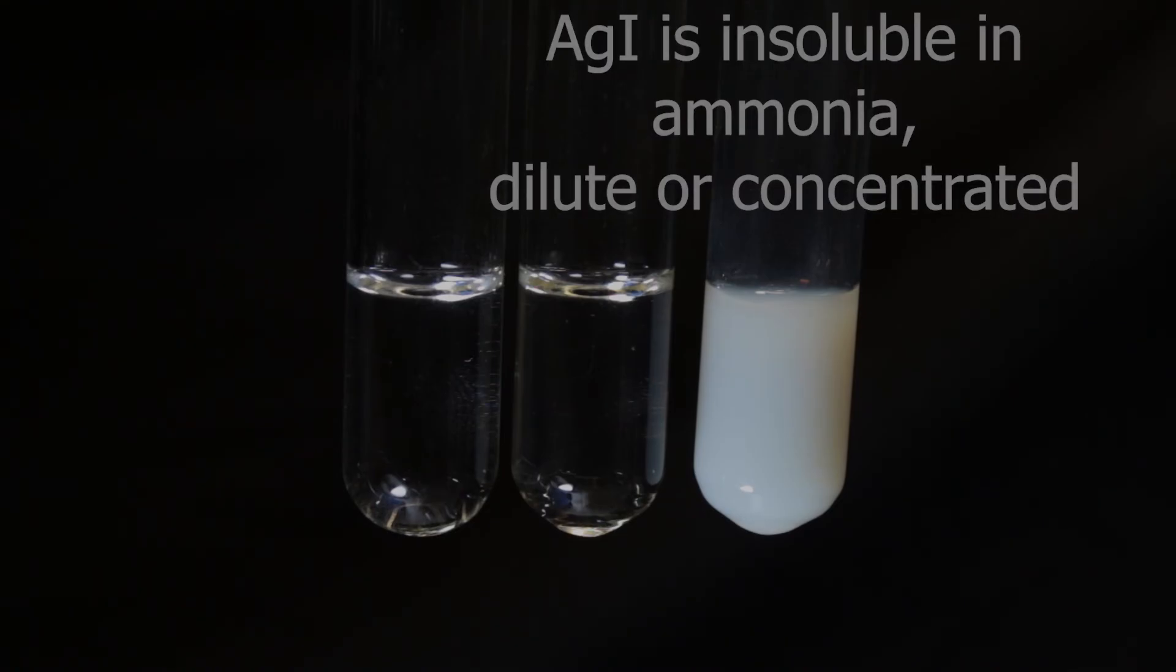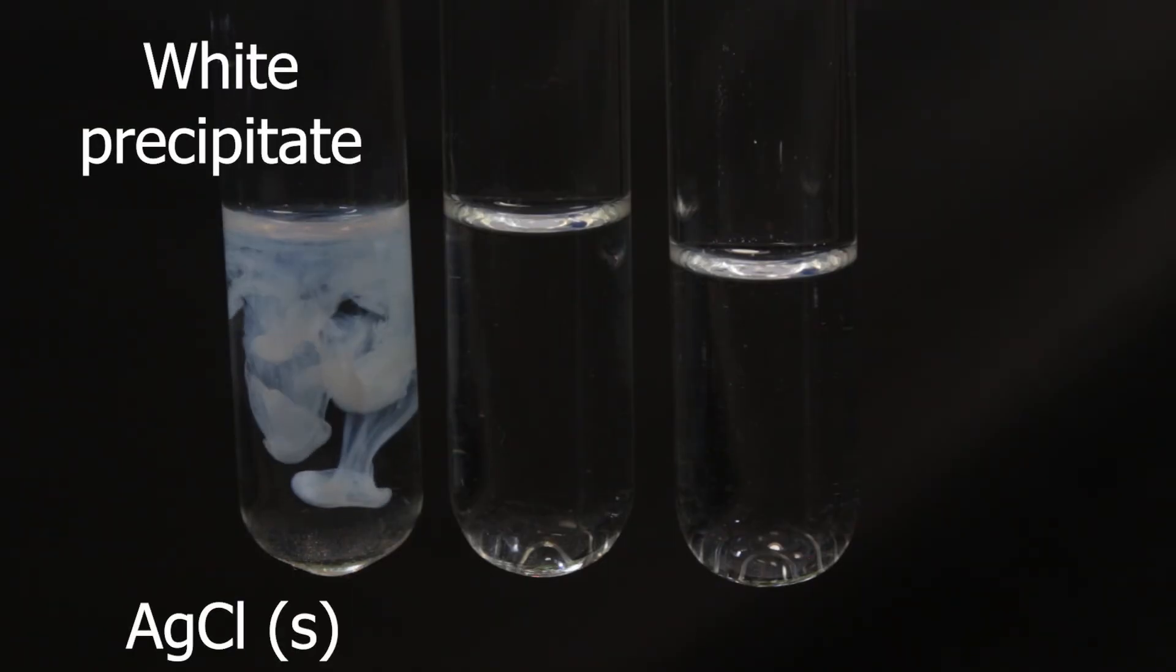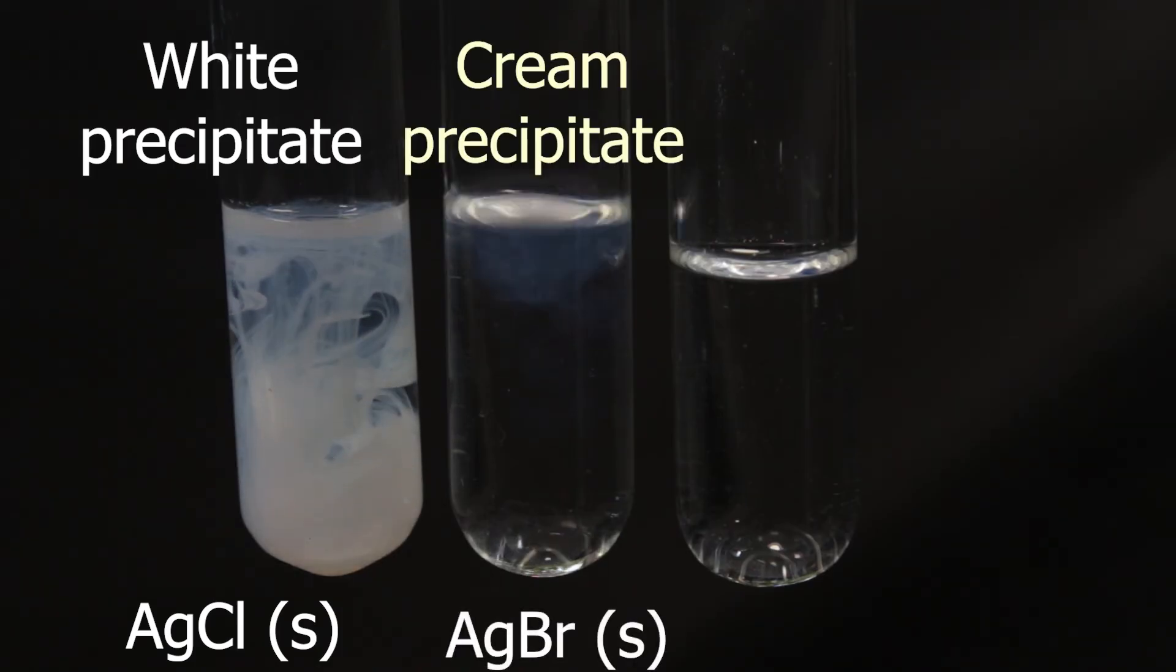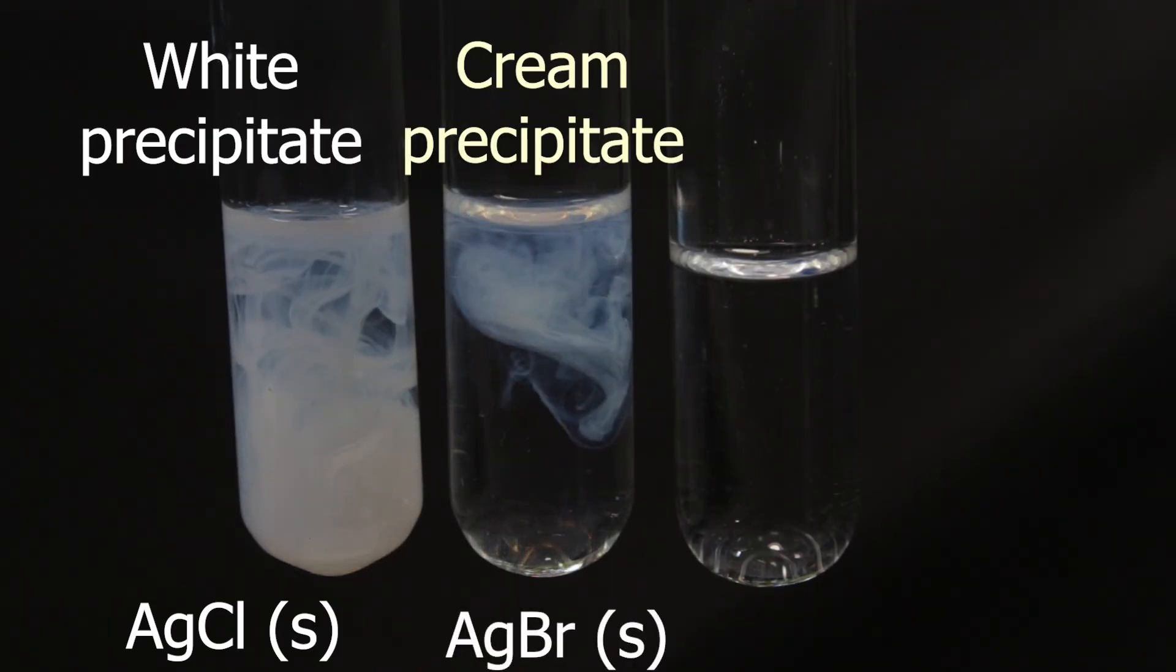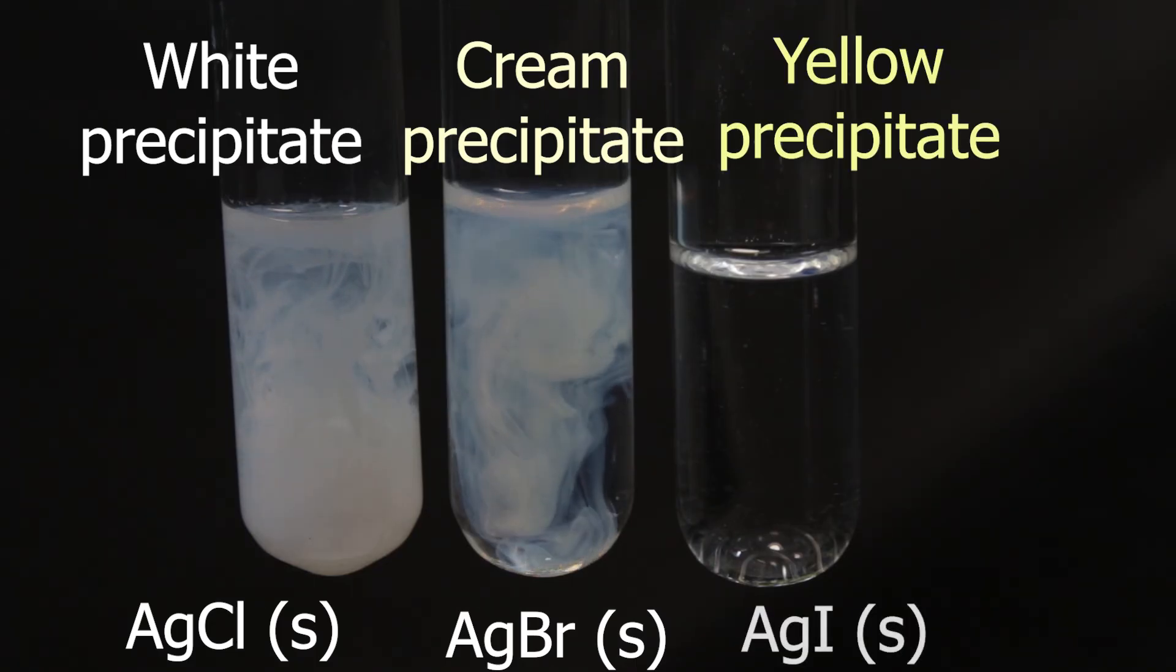So let's go again over the test. Acidify the solution with nitric acid. Add few drops of silver nitrate. Observe the color of precipitates. Silver chloride is formed in the first. Silver bromide in the second test tube. And silver iodide precipitate in the third.